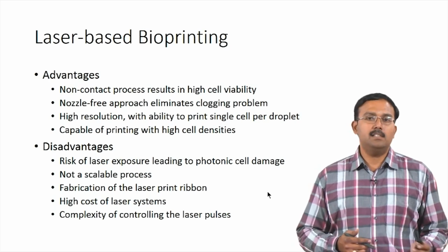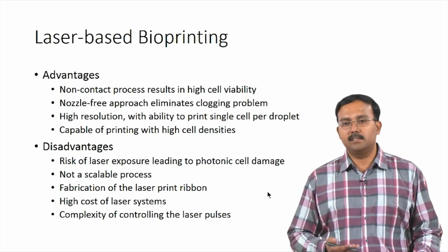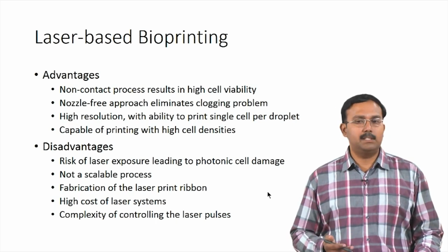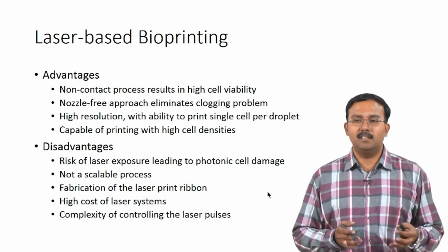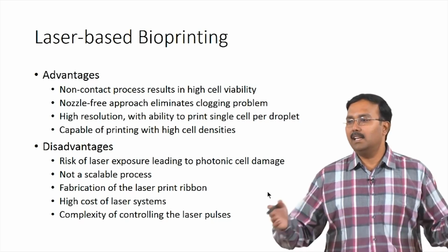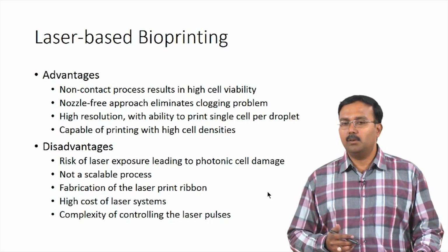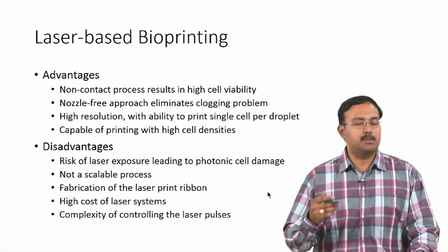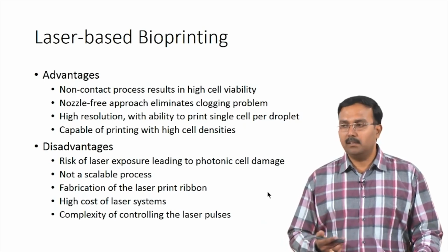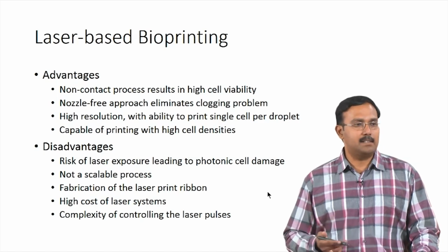But the disadvantage is you always have the risk of laser exposure to the cells, leading to photonic cell damage, and this is not really a scalable process. It is really expensive to build something like a laser setup even for a small system. If you are going to have a very large scalable system, that is not going to work. From a commercial perspective, which is eventually where you want to go, this is probably not going to be viable, and it is also a very high cost for laser systems.